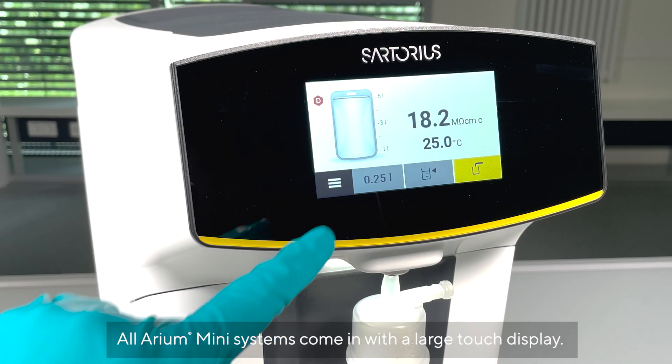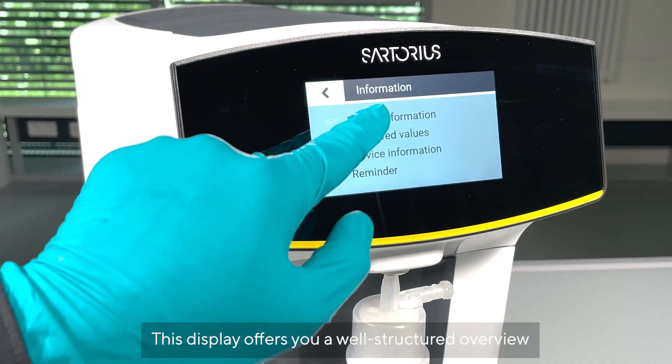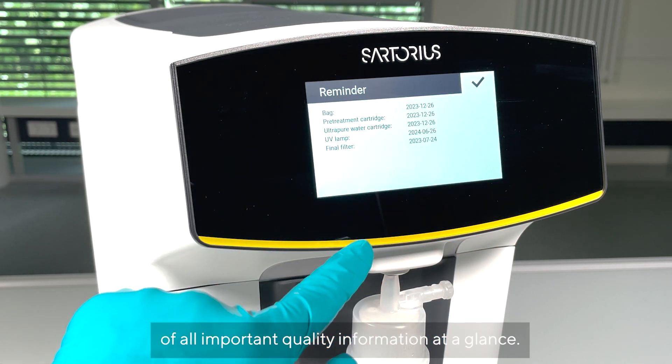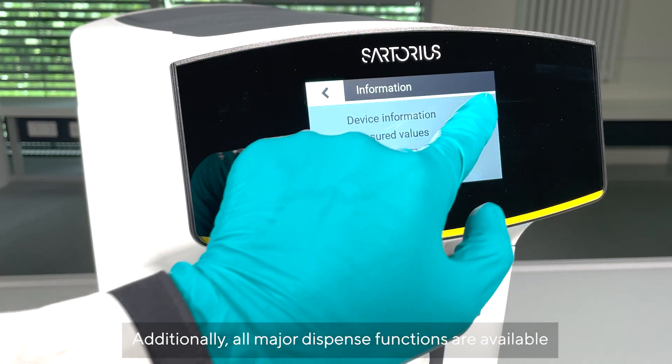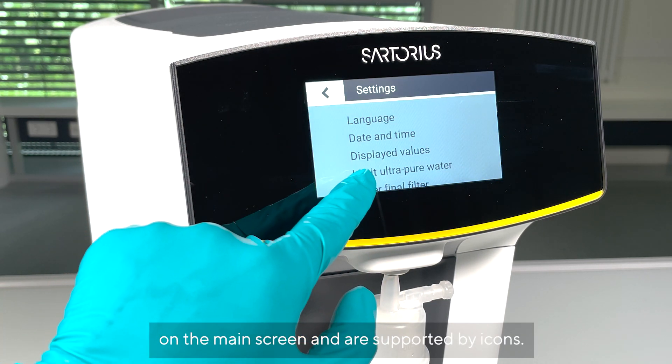All Arium Mini systems are supplied with a large touch display. This display offers a well-structured overview of all important quality information at a glance. Additionally, all major dispense functions are available on the main screen and are supported by icons.